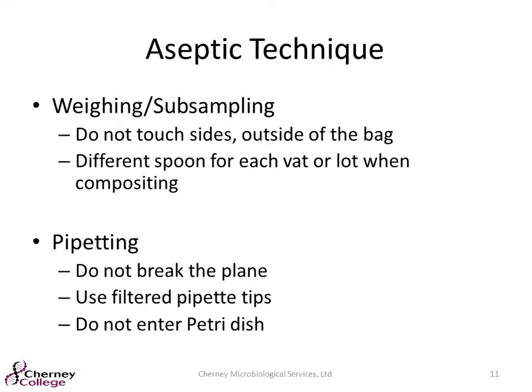When we talk pipetting, a couple of key things. You want to remember that the actual pipette itself is not sterile. You can clean it, sanitize it, but most of those are not autoclavable. So think of that full plastic portion of the pipette as a potential contamination risk.